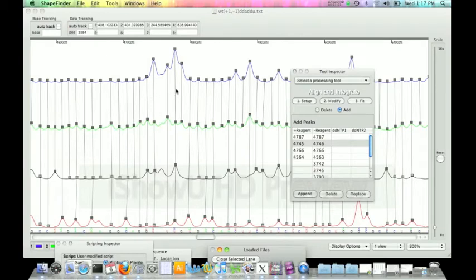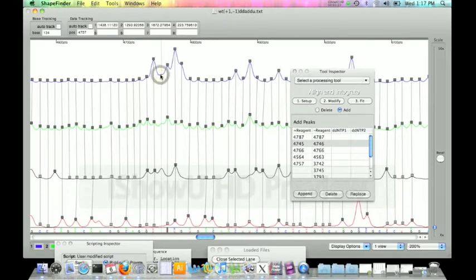Looking for unusual spacing. Essentially, if there's some unusual spacing, the CEQ just didn't get a big read for that specific nucleotide, so you really should go ahead and just add those in. So I think that there's some unusual spacing here, and I see some little bumps here, so I definitely say there's a peak here. So I'll go ahead and add those in. Alright, no problem. Oh, beautiful.